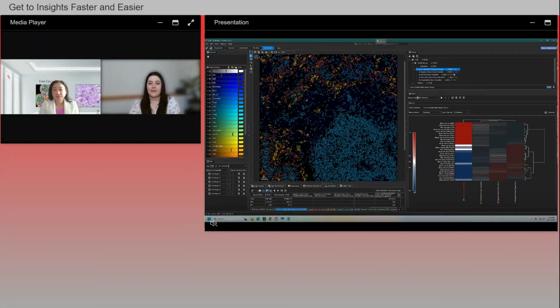Wonderful, thank you. All right, moving along here. Our next question asks, my images have a lot of intensity variations. Would I need to train SBE on multiple images?